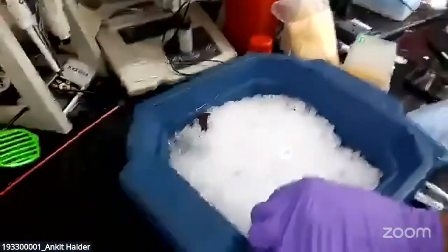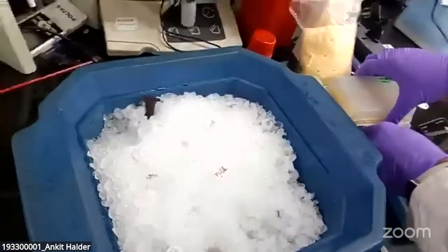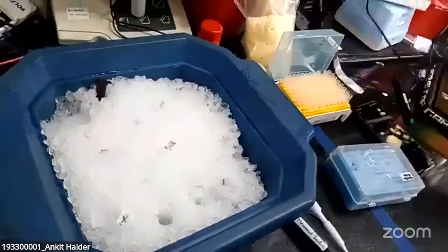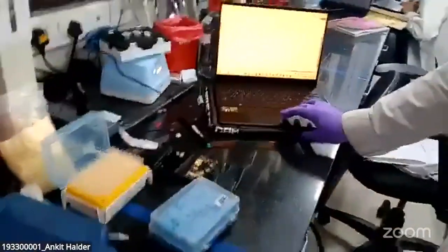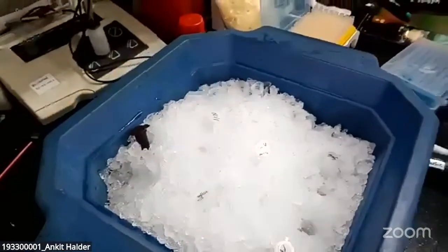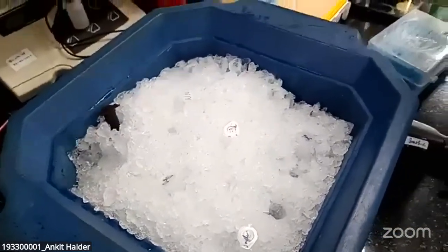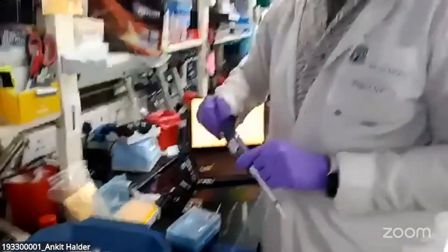Now, the very first thing is that you can see we need a total of 30 microgram of protein. So we will take the sample here. You can see here the total 2.97 microliter contains that 30 microgram of protein. Now we will take only 3 microliter, 2.9 microliter of protein from the lysate.